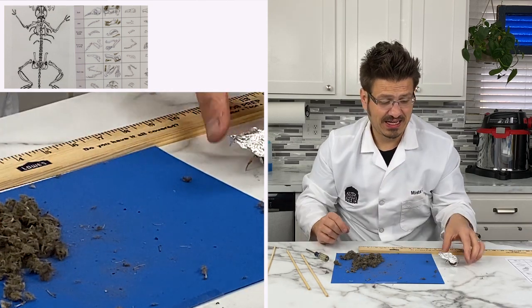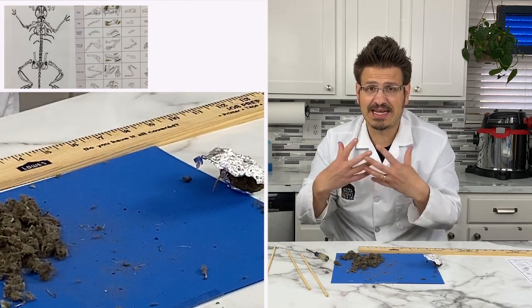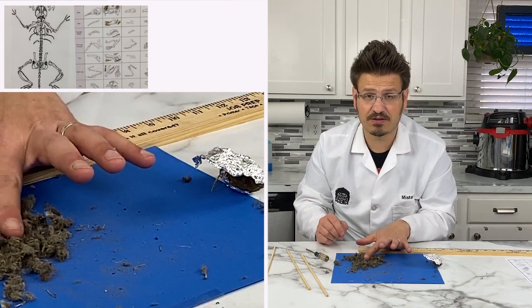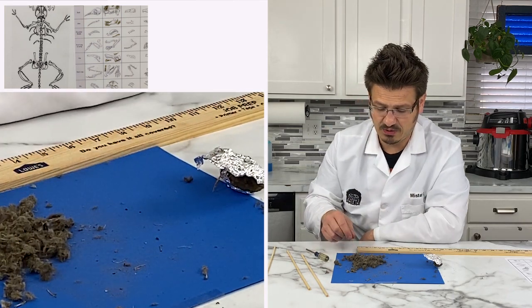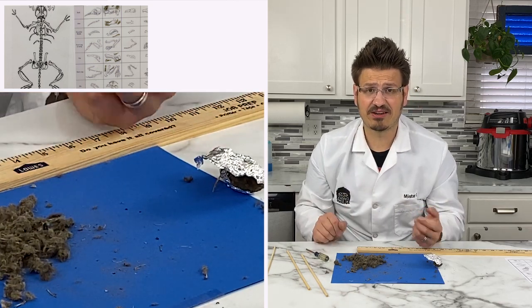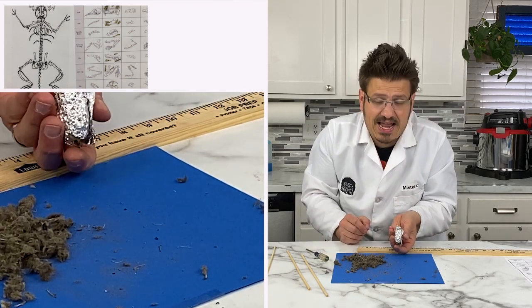And basically, this pellet is formed because all of the juices, all of the soft parts of the mouse get digested by the owl. The owl needs energy, so that's why it eats this mouse. These are all the parts from the mouse that the owl can't digest in its system. So what it does, squeezes and squeezes and squeezes, and eventually, when it gets hungry again, it says, oh, I gotta get that out of my stomach, and then it does this. It goes, bleh, and it spits that out.